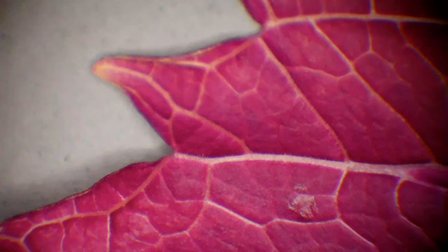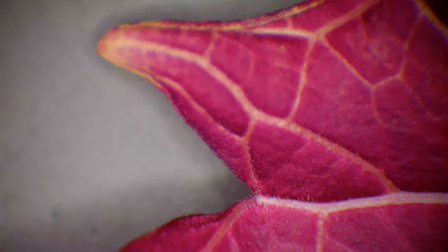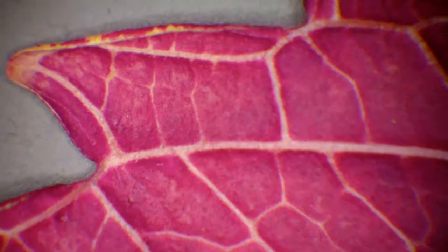We will soon change to the compound microscope instead. But before we change to the other microscope, we take a quick look at the back side of the leaf also. At this side we can clearly see the veins on the leaf.